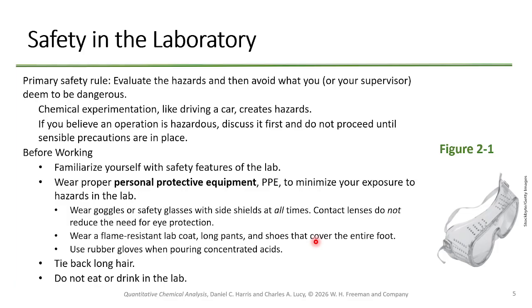I'm not going to require it, but honestly speaking, I probably should in the future. If you guys want to wear a lab coat, it would be recommended, just so you don't spill on your clothing. Most of you are wearing nice enough clothing that you probably don't want to dissolve it. So if you're going to go to a meeting after this, seriously, wear a lab coat or something.